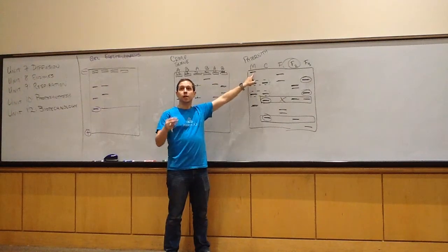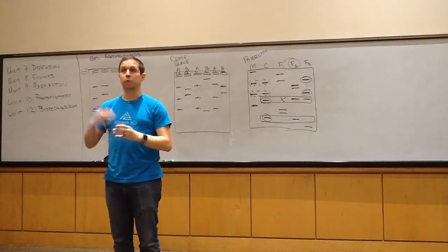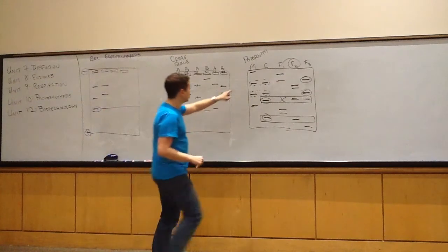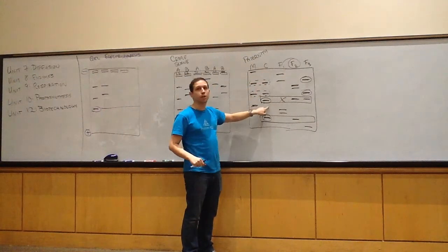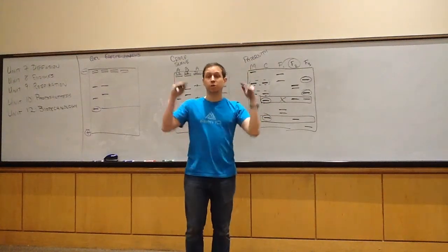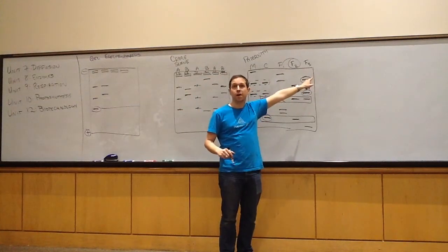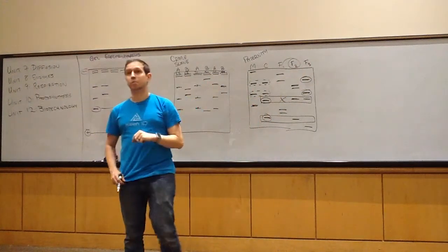No, but seriously, if you know for a fact what the actual maternity of the mother is and what chromosome she donated to that child. So notice, the mother doesn't share this band with that child, and the mother does not share this band with that child. If you already know this woman is that child's mother, you start with her first because you know they have to share DNA. We don't know if any of these people are the father of that child. That's why we're not going off of the fathers first and then the mothers.